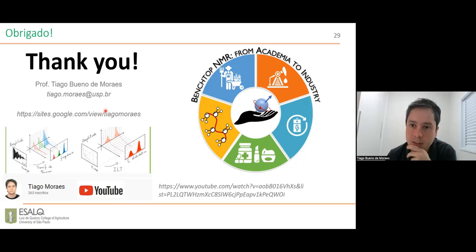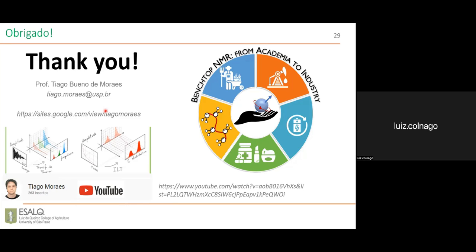Colnago? Answer that. In CPMG, if you collect only certain echoes, not the 1, 3, but only 2, 4, 8, this inhomogeneity is compensated because you turn just 180 degrees around the y-axis. After the first one, you have some problems with B1 inhomogeneity, but when you reverse the 180 degrees, you have the same imperfection going in one direction and you return in the second direction. Then the signals that are, for example, echoes 2, 4, 8, are always compensated for that problem with B1 inhomogeneity. That's the way CPMG works. For example, you can use a 90-degree pulse and still have a very good CPMG decay.